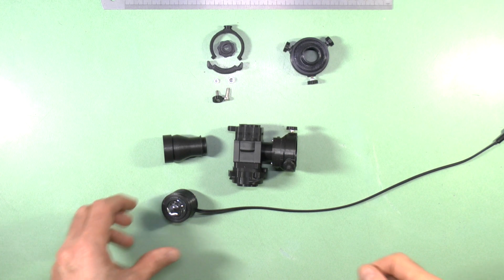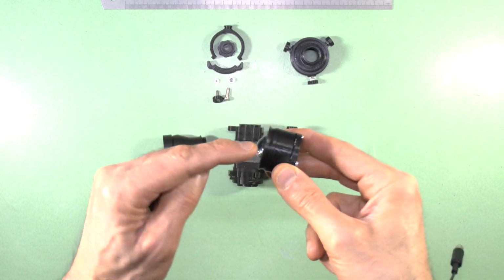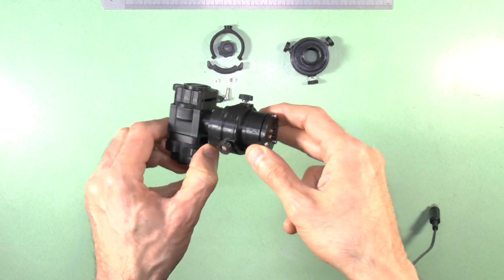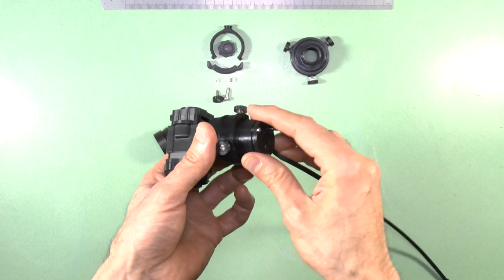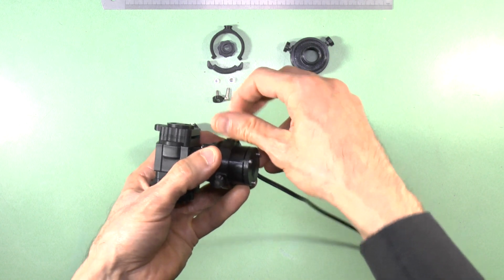To complete the assembly, attach the LED lamp and lower collector with the LC adjust collar in place to the M3 adjustment ring component as shown. You can vary the angle of the illuminator to get the best even illumination, similar to the adjustment shown in the video on the polarizing condenser.